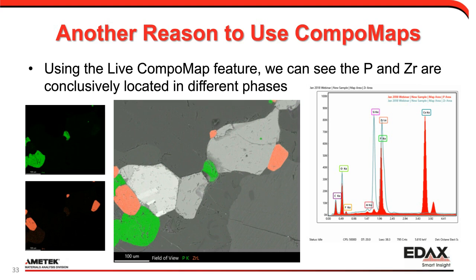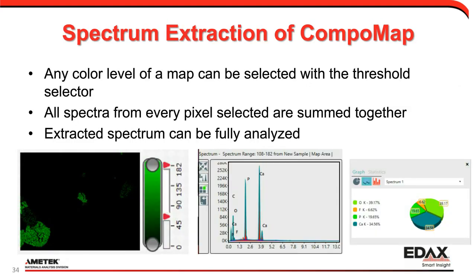So now, moving into the most advanced of our investigative tools available to us, if we were to say, okay, well, great, I see that phosphorus area, I want to explore it even further. So now we take the phosphorus map and we use the scale bar here. The phosphorus display is a display of the intensity or the concentration, whichever one you have selected.